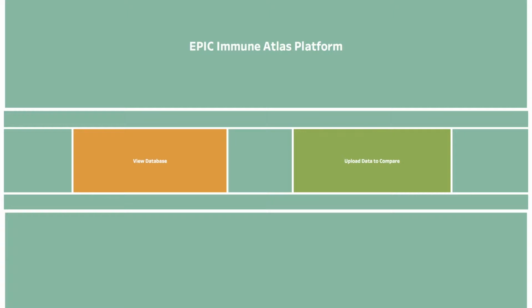So in this platform, scientists or researchers from all over the world are able to upload their mass cytometry data onto our platform and run it through our pipeline analysis automatically and get to compare it against our database. So before any comparison is made, let us look at our database first before we start to explore the analysis process. Users could click here to view the healthy database.